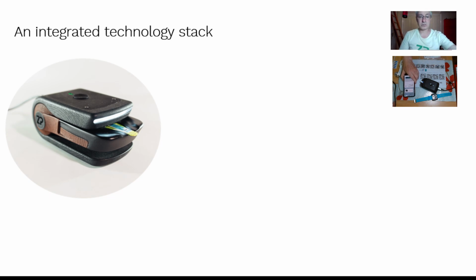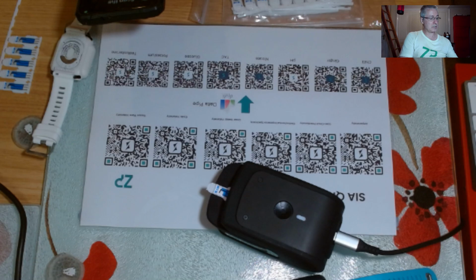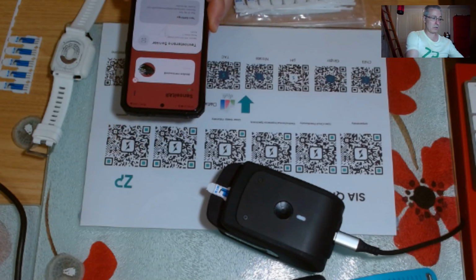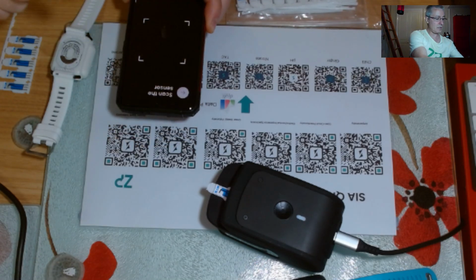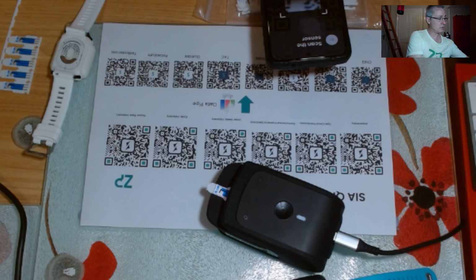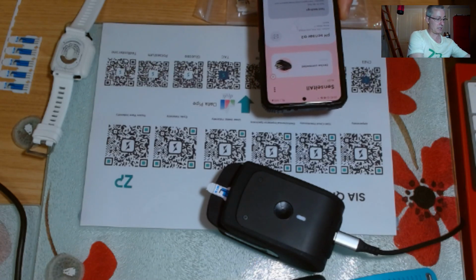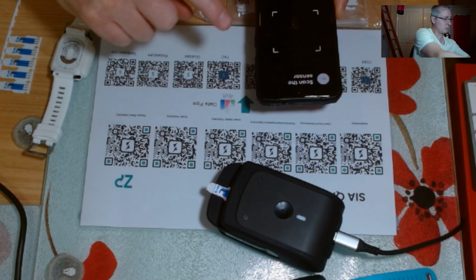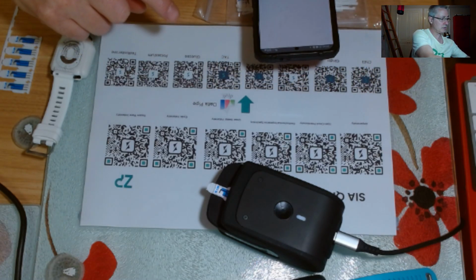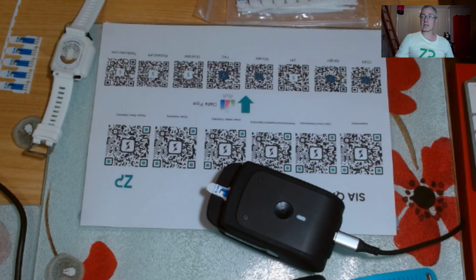I should actually just change screens real quick. So if you come to us and you want to do one of the hormones and it's testosterone, then by scanning the QR code I can do testosterone. If I scan that, that was potassium, I didn't want potassium, I wanted pH. If I scan the, sorry, I keep doing that slightly off screen, but that's pH. And then the other one you were interested in was nitrate. And I can scan the nitrate one and also get to nitrate as well.